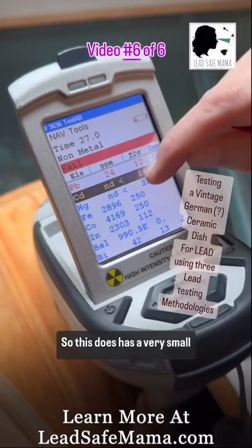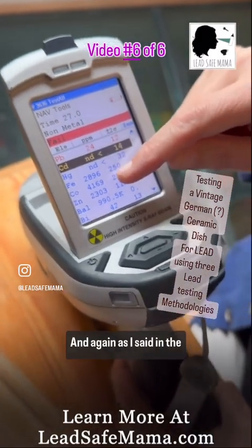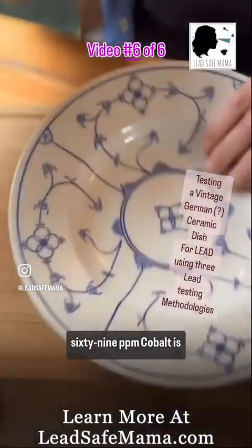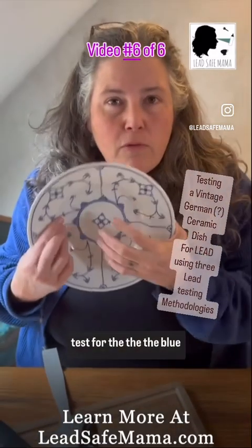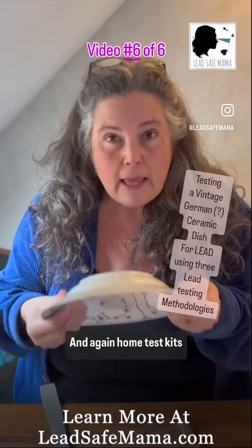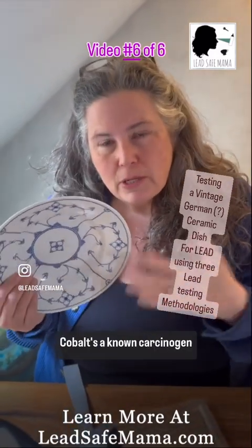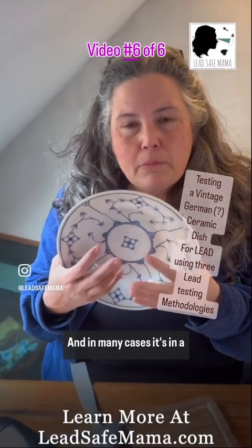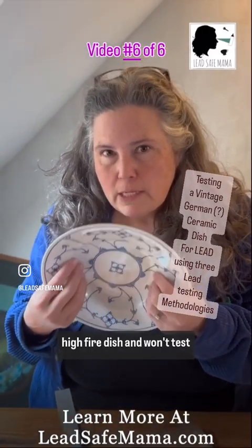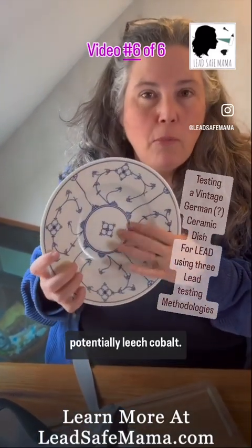So this does have a very small amount of lead — 24 parts per million. And again, as I said in the beginning, it has cobalt at 4,169. Cobalt is usually what you come up with when you test for the blue glaze in a dish like this. Home test kits aren't going to test for cobalt. Cobalt is a known carcinogen and a poison. In many cases it's in a high-fire dish and won't test positive for lead, but may potentially leach cobalt.